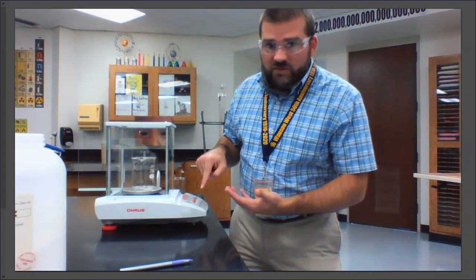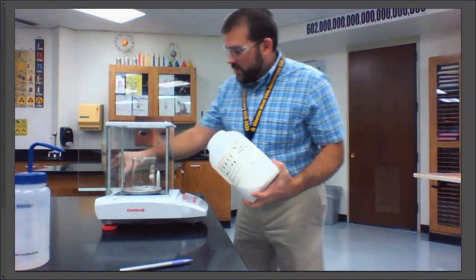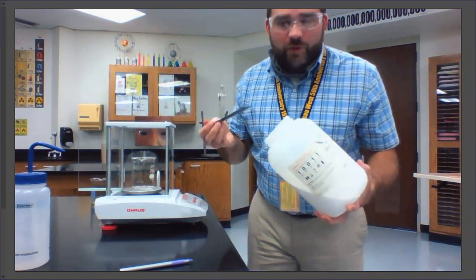So instead, I'm going to put the beaker on there, tare the balance, which is what it's called, and that makes it 0, and now I can add my sodium carbonate. I'm going to use this, which is called a scoopula. Okay, it's kind of like a spoon-knife hybrid.